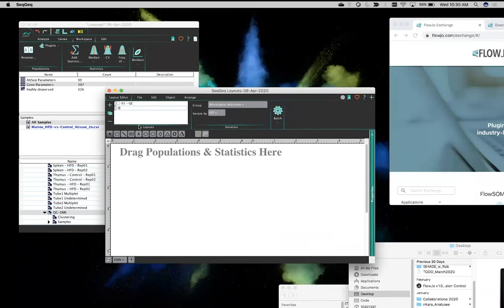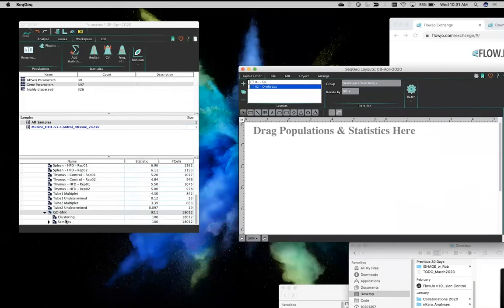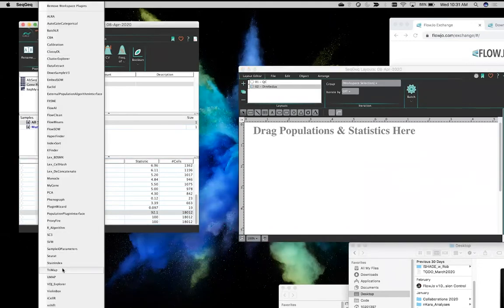And in our next step, sometimes I'll do manual gating next, but I think for this demo, I'm going to jump straight into dimensionality reduction. So I call that DIM redux, just short for dimensionality reduction. And for dimensionality reduction, we have a variety of different features available. I'm going to kind of show you some of the newer stuff that we've come up with, and just recognize that there are definitely other ways that you could do dimensionality reduction if you so chose.